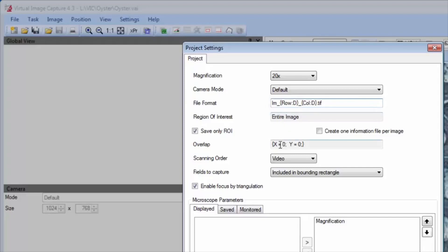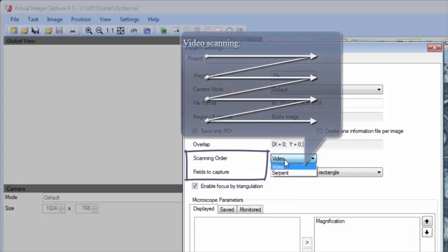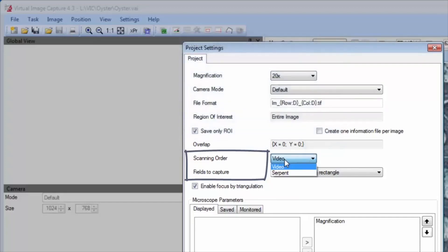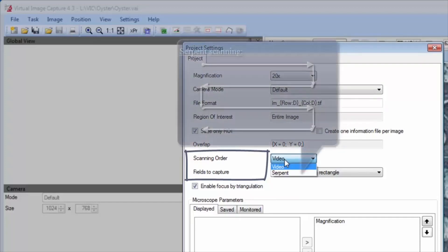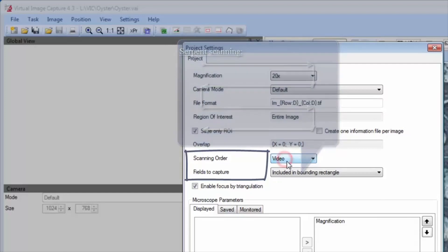The sequence of image capture is set by scanning order and fields to capture options. There are two basic scan patterns. First is video scanning, which captures images row by row starting from the left. Second is serpent scanning, which captures images while alternating between forward and backward scanning.